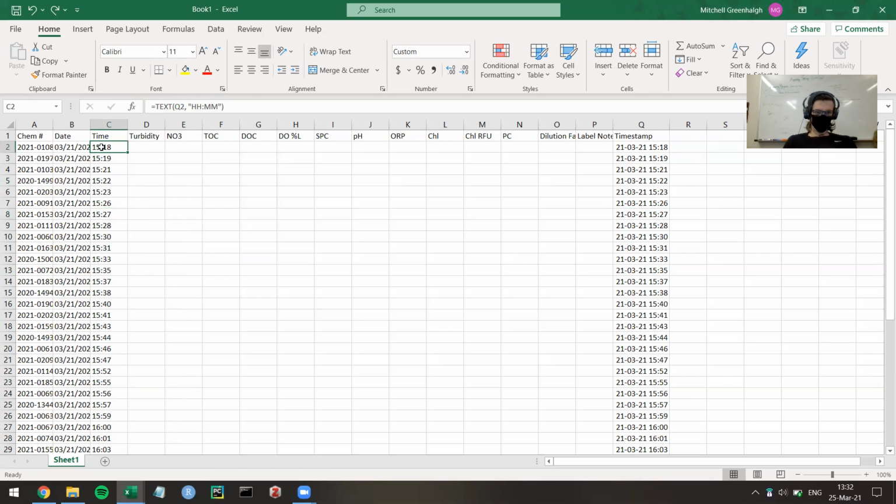And so it won't cause us problems later on. So I'm going to change that back. So that is all good. And now we need to enter in all of these data.